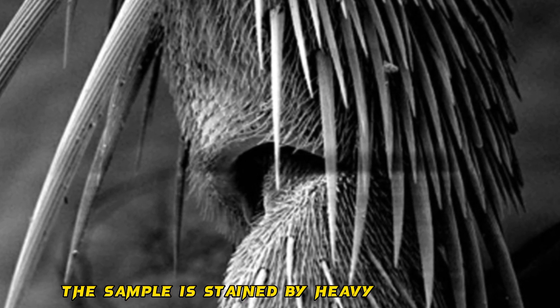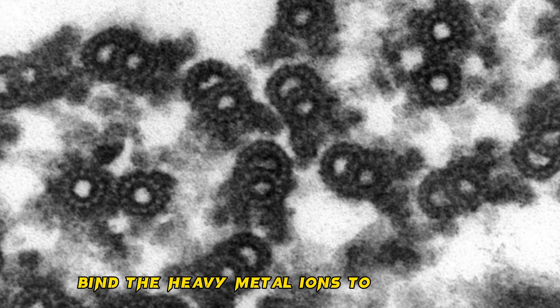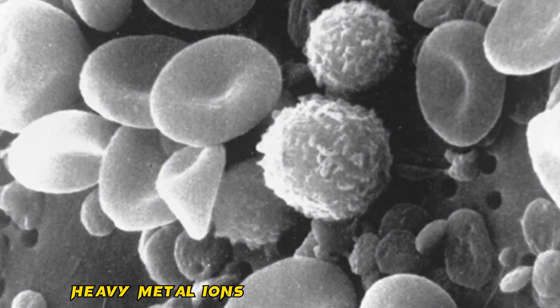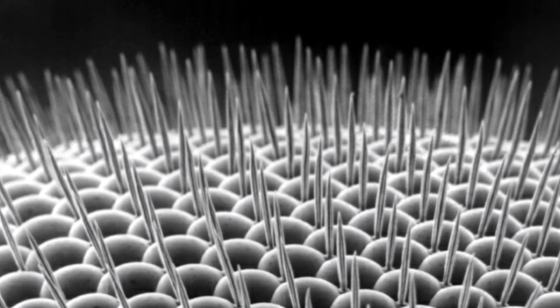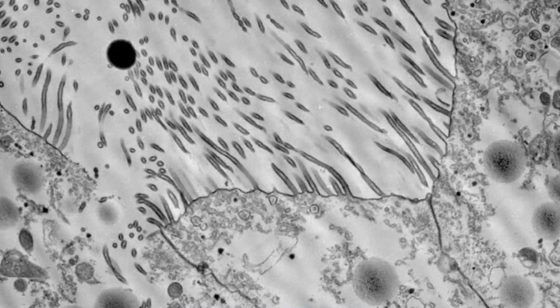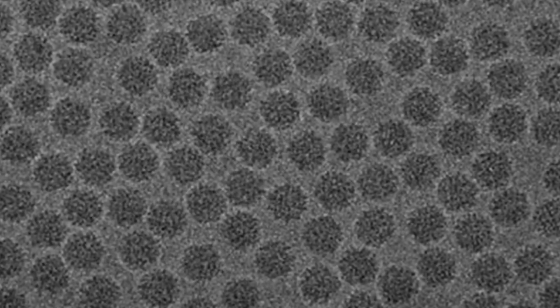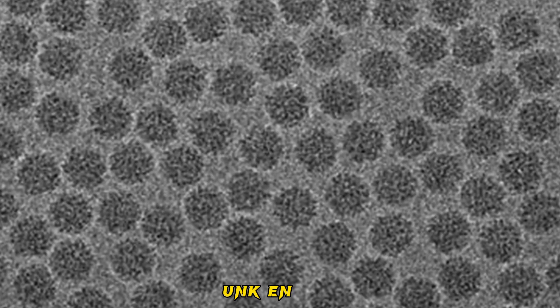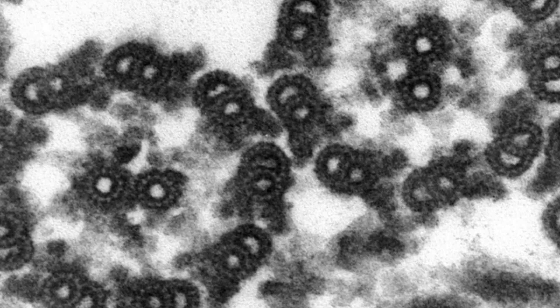The sample is stained by heavy metal salts. Different parts of the sample bind the heavy metal ions to different extents. Heavy metal ions scatter electron beams and thus cause dark areas on the image.